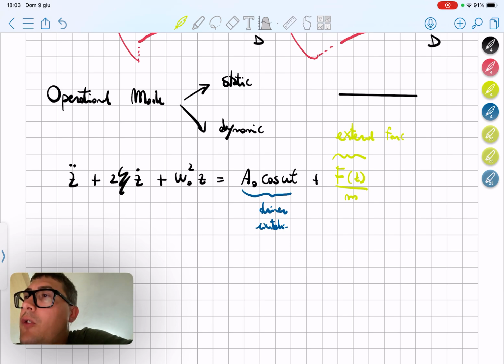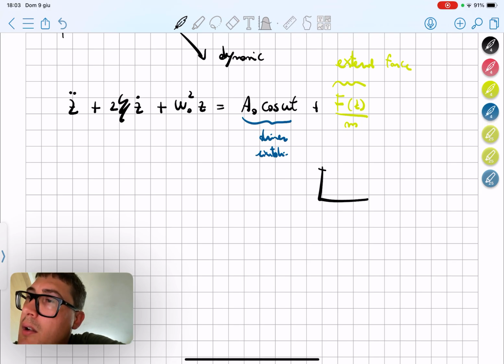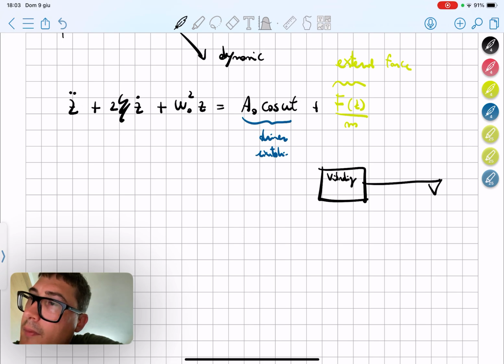external. So this external force is actually due to the tip-sample interaction, whereas this driven excitation is because the cantilever itself is connected to a vibrating driver, which is effectively moving, shaking up and down.